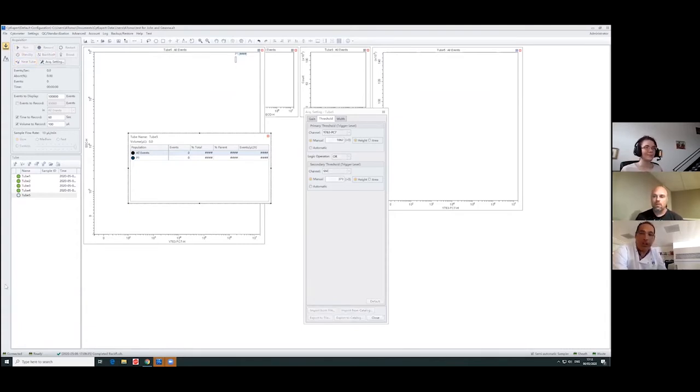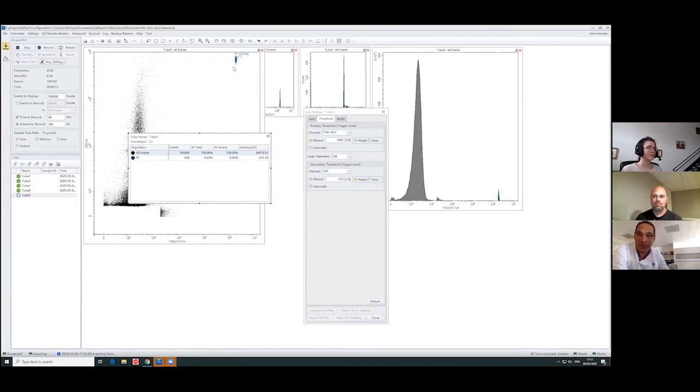So first thing, these beads tend to be quite sticky, and that's why I want to wash them away. Okay, so I expect to see, there you go. The first thing I want to see is this, okay? I want to see that problem on that side. I want to see that stickiness in my sample, and that's a carryover, okay? So you have to make sure that we don't have any carryover from one side to another.